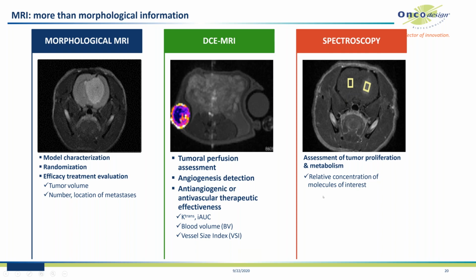We can also go beyond the water signal and try to have information about the metabolism of the tumor.